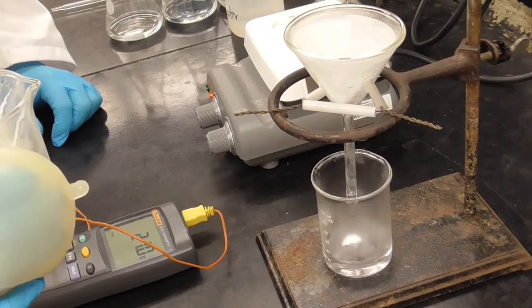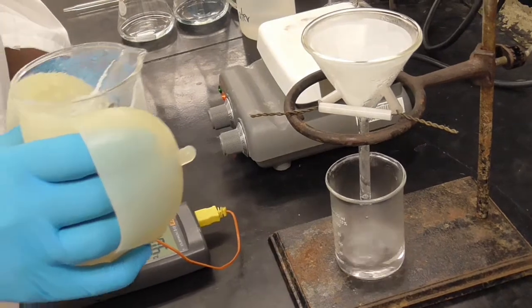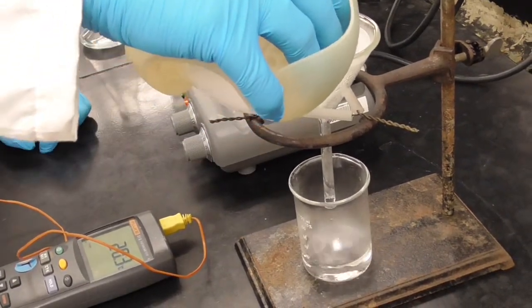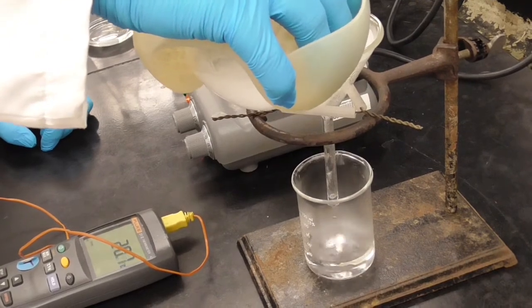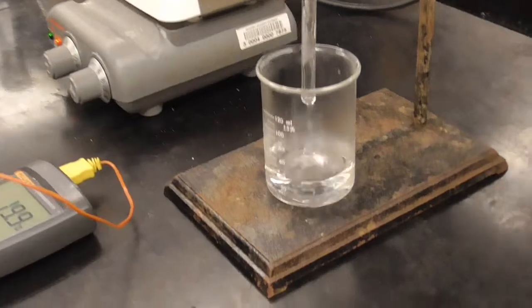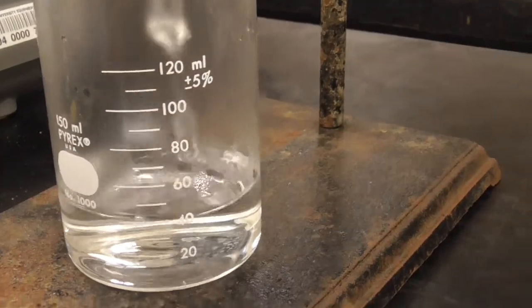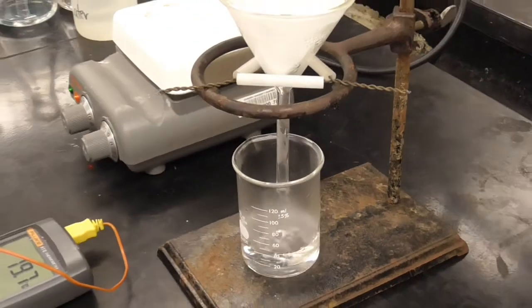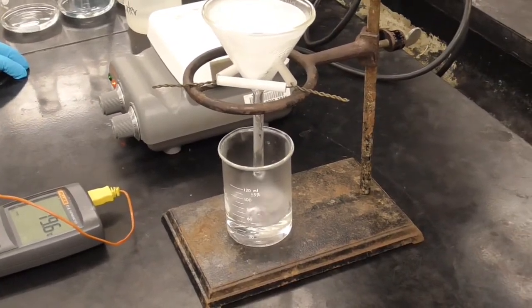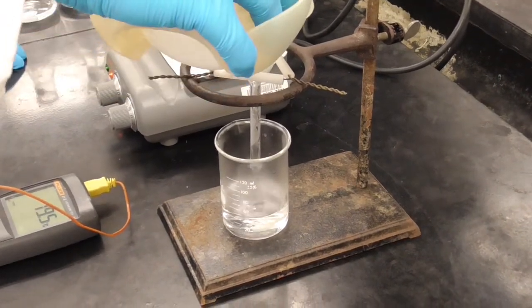Now we only need enough so that we can set up our 4 titrations. So we need about 40 milliliters that we're going to have to pipette. So we don't have to filter the whole thing, but we just need to get enough. And I want to get at least enough so that we have enough to pipette. We're doing it as fast as we can, so that we don't change the concentration or the temperature too much.